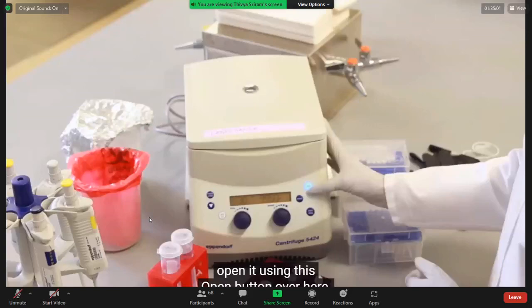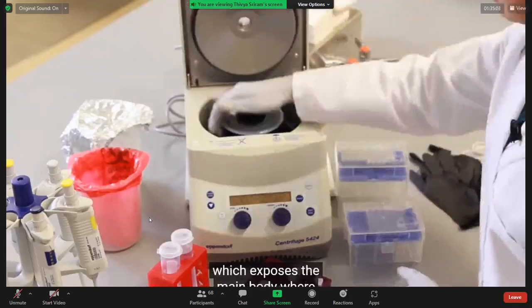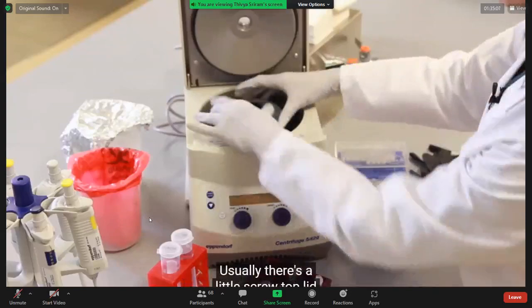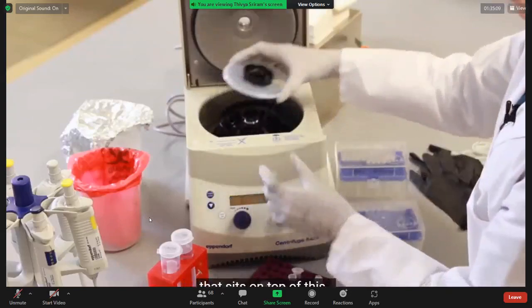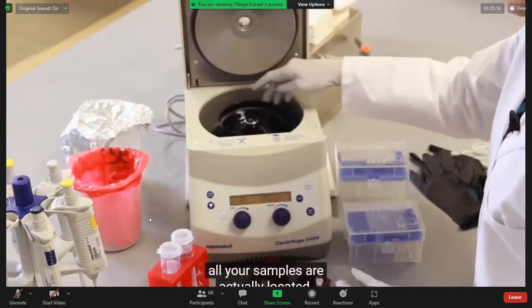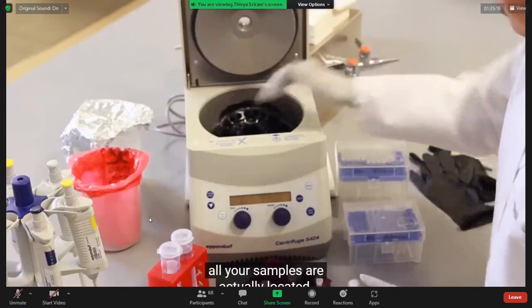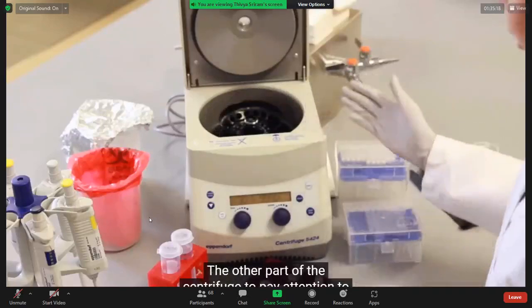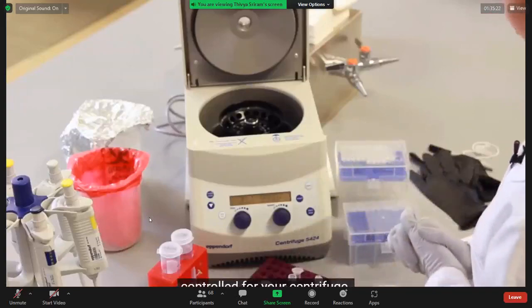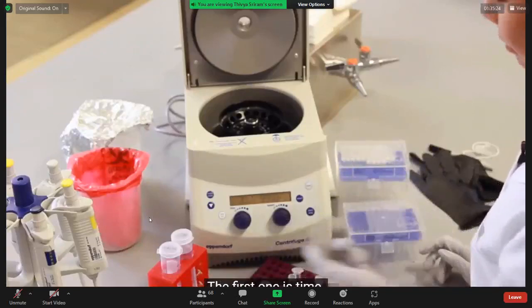When I approach a centrifuge, I can open it using this open button over here, which exposes the main body where the centrifugation happens. Usually there's a little screw top lid that sits on top of this, which when you pull open, you'll find the areas where all your samples are actually located. The other part of the centrifuge to pay attention to is the menu body here, where all your different settings are controlled for your centrifuge.